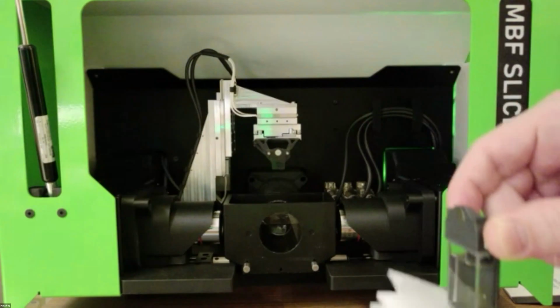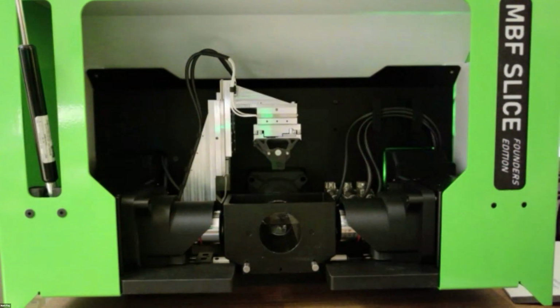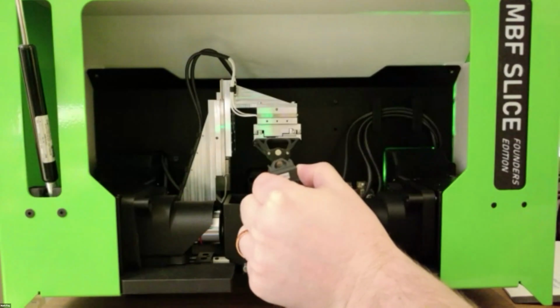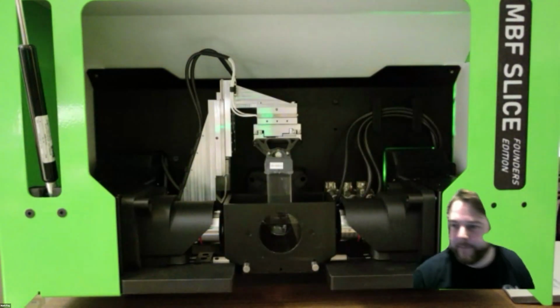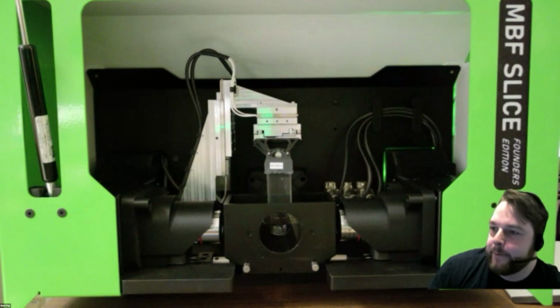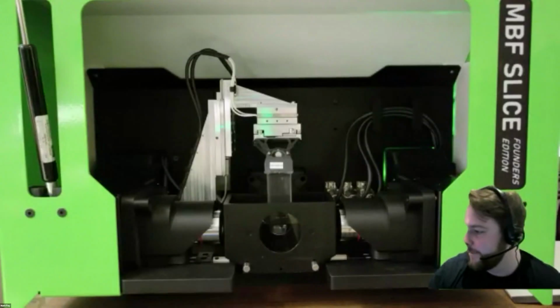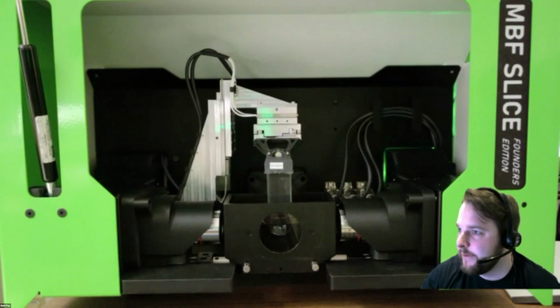It is fairly clear. But really day to day, your interaction with the actual hardware is really just taking your sample, and we're going to go right up to this magnet attachment to the stage, and we're just going to clip it on there, and we're good to go with the system. Pretty much everything else you're going to do with the Slice is controlled through the software interface itself. So I'll go ahead and now share my screen. And Peter, if you could let me know when that actually loads, that would be great.